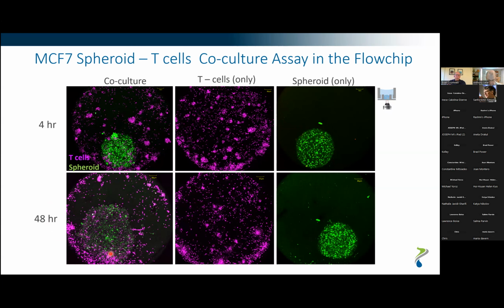And so then you're able to use this as a way to look at different therapeutics that can increase interaction, or if you have a tumor model, a patient-derived model, now resistant to the immunotherapy, how do you overcome that resistance? And so that's the way the groups we're working with are taking this, and really the future for looking at immuno-oncology, again, in a functional manner.